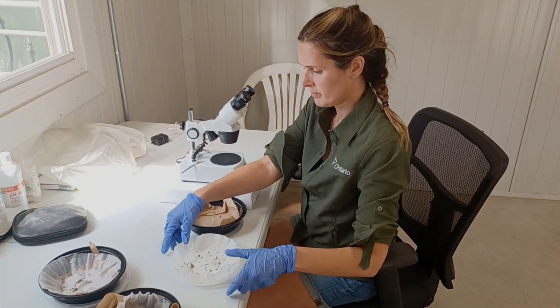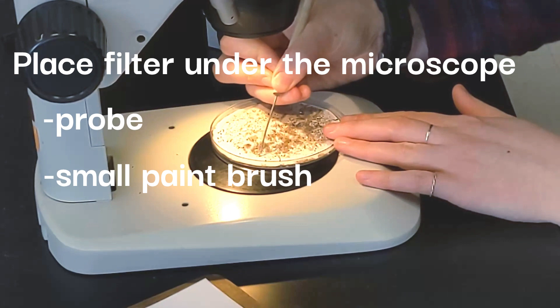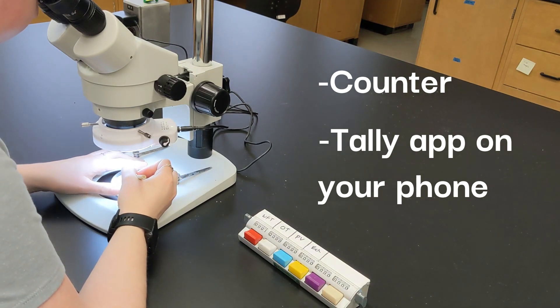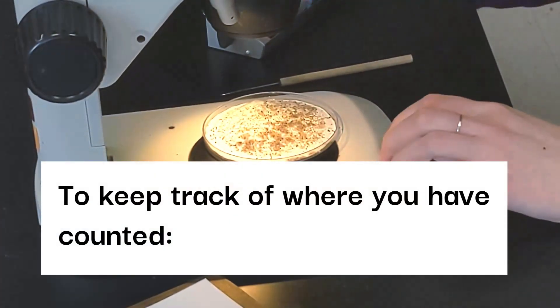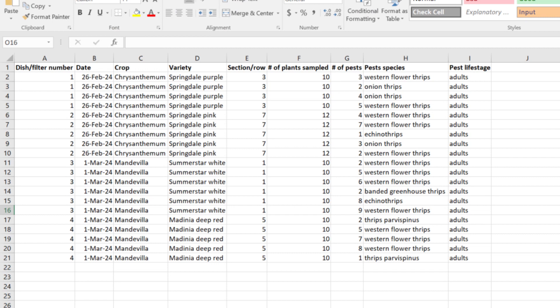Place the filter under the microscope and using a probe or small paintbrush, sift through the plant debris on the filter to look for thrips or other pests. Use a counter or tally app on your phone to record when you see an insect. If you are counting multiple species or life stages, have a different tally for each. To keep track of which section of the grid you have counted, put a dot next to that section once it is complete. Once you have all of your data, be sure to enter it into a spreadsheet or scouting software. This way you can compare insect pressure or the number of different species present for factors such as different varieties, the time, the year, or before and after management strategies.